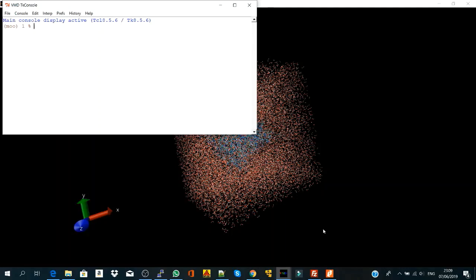So this is simple. Let's first assign our system or selection. I'm going to say set. Set is used to declare a variable in TCL scripting. So I set all. You can make it set Muhammad, set A, set B, but I'm used to this language. Set all, and I go atomselect top all, and let's close it and hit enter. So now I selected all the atoms in my structure.